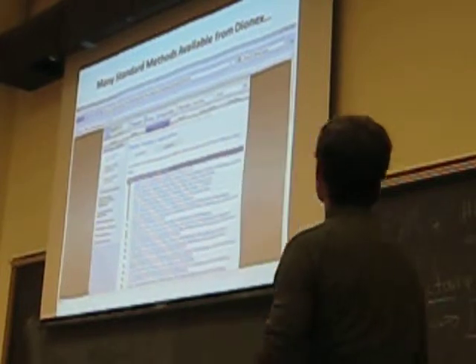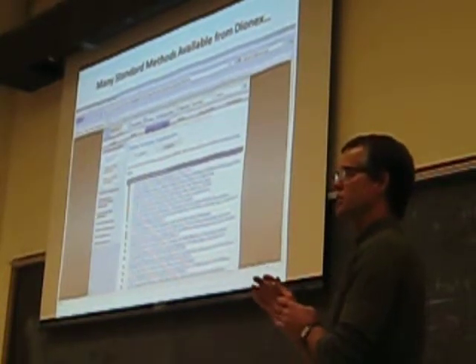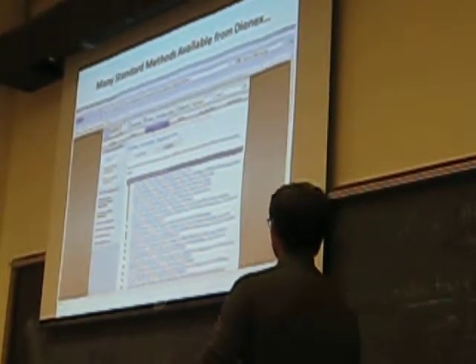So I mentioned before, there are a lot of applications that different companies develop, and their bread and butter in developing applications is developing columns to meet certain applications. Sometimes people from this class go into environmental consulting positions, where they do a lot of analyses of environmental samples, from wastewater, effluents, a whole variety of things, where a lot of monitoring is required because of EPA regulations.